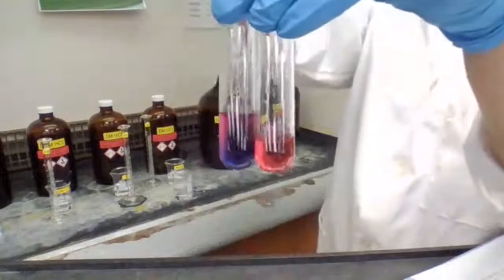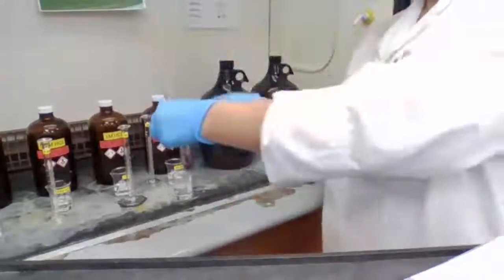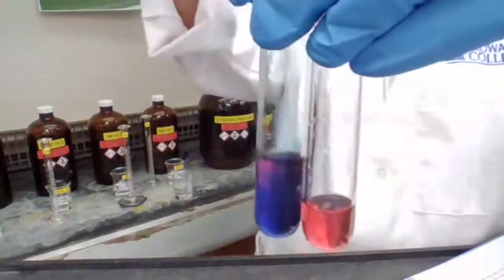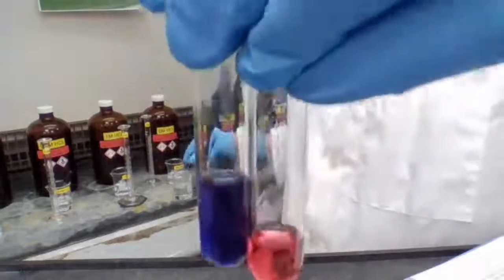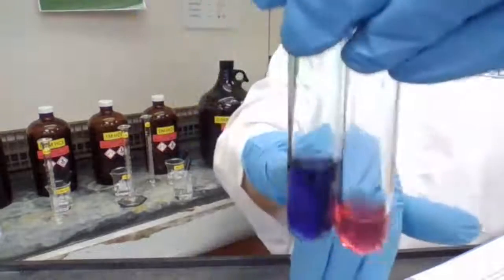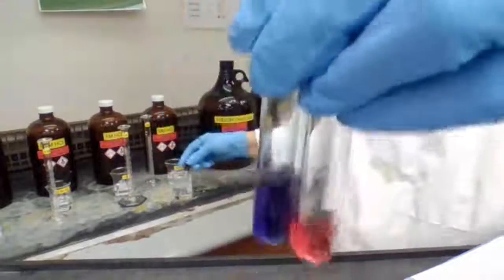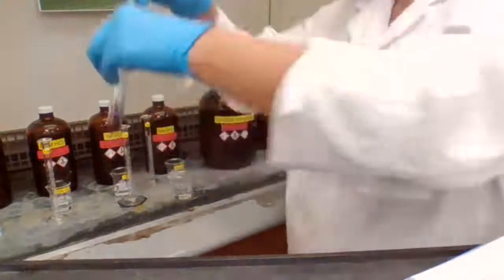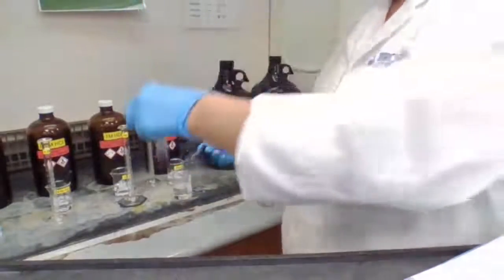It's a good comparison to see what color changes take place by adding HCl, because I only added it to one of the test tubes. So there is a color change there. I want you to record what is happening after adding HCl, and I'm going to add HCl to the other test tube as well. Adding concentrated HCl.